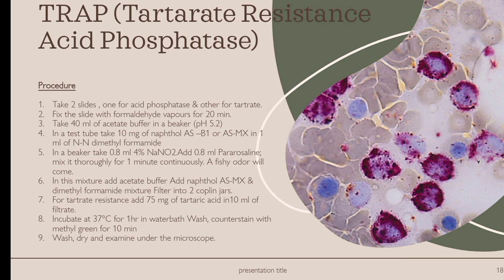For the tartrate resistance, add 75 mg of tartaric acid in 10 ml of filtrate. Incubate at 37 degrees for 1 hour in the water bath. Wash and counterstain with methyl green for 10 minutes. Wash, dry, and examine under the microscope.